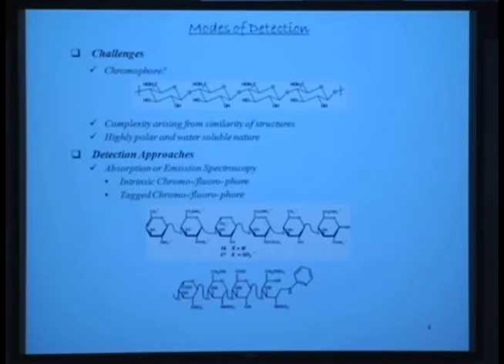With heparin, you don't even have to go to RI. Unlabeled heparin, you will typically be able to detect easily at 206 to 210. Obviously, if you label it, then the detectability increases dramatically, but you can still do it. In fact, I have a slide. Low molecular weight heparin we detected at 206 or something like that. All right. Any questions?